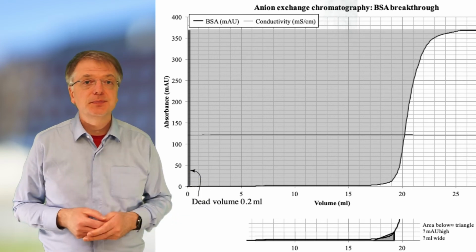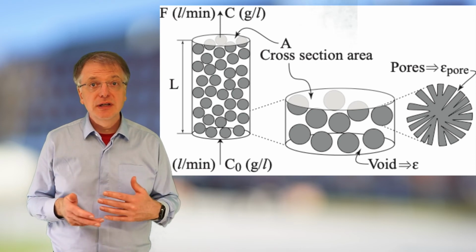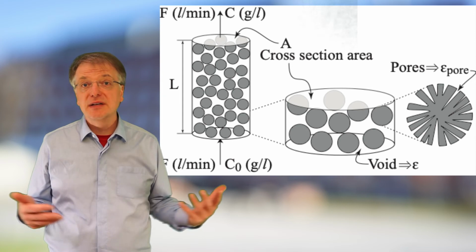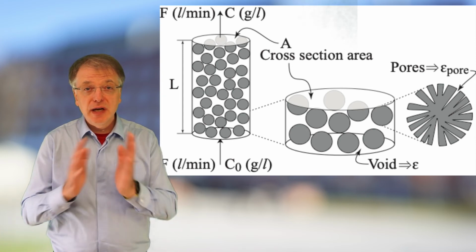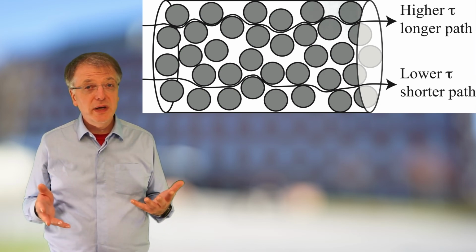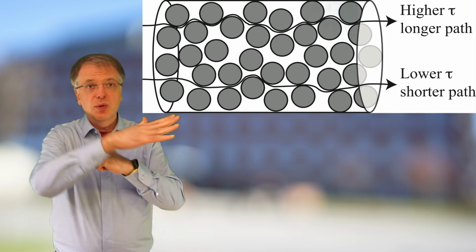it makes. In subtask B, you should calculate the superficial velocity and the real velocity. The superficial velocity is the velocity the flow seems to have if you think of the column as being empty. The real velocity through the column depends on how tightly packed the column is. This since the flow cannot flow through the particles. It has to flow around.